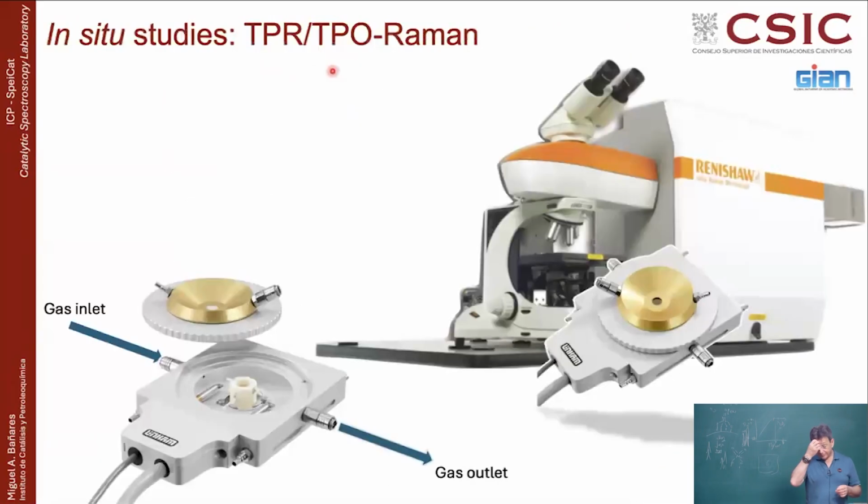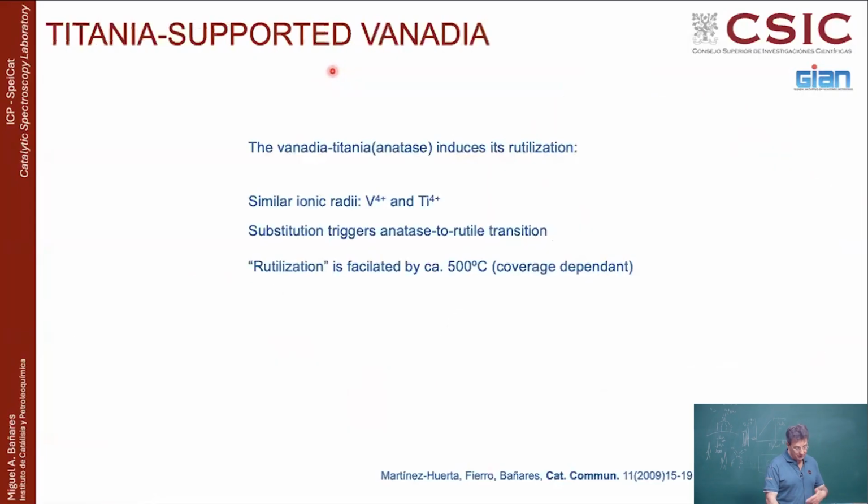Now, you can do more things. We have been heating, but if you are heating in air, or in helium, why not heat in hydrogen? Why not heat in methanol? Why not heat in many things? Because then you can see what happens under a relevant reactive environment, during oxidation, during reduction, during oxidation.